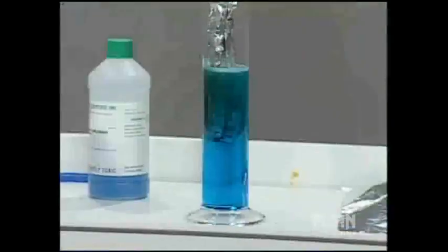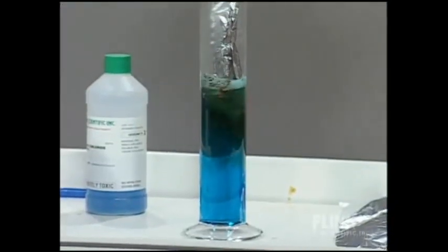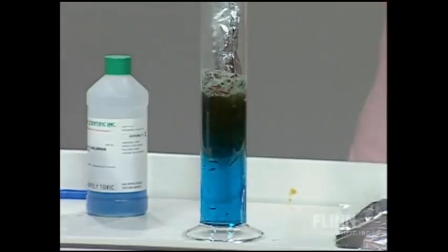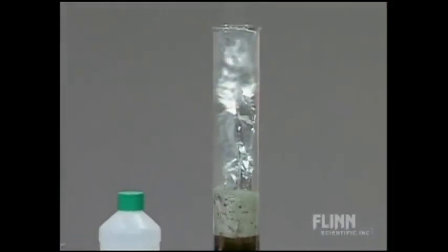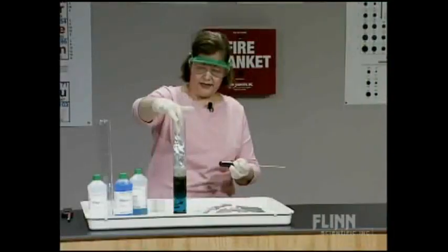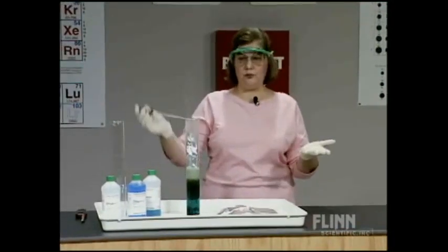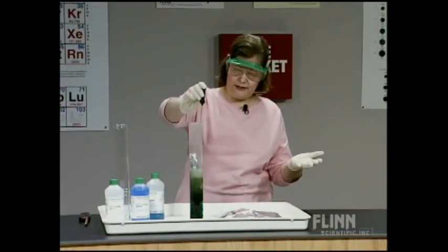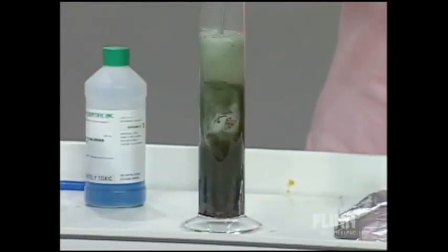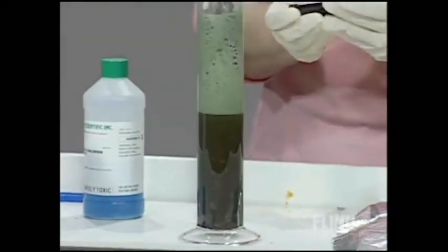What do we see? Bubbles immediately, a color change, blue going, oh, smoke, oh my goodness. Okay, and there's some red solid, and that red solid is falling to the bottom. It's really bubbling pretty heavily there. I can get that aluminum foil. It's almost as if the aluminum foil is disintegrating. I'm going to push that in a little bit. So it's disappearing. So what we have here, we obviously are getting quite hot.